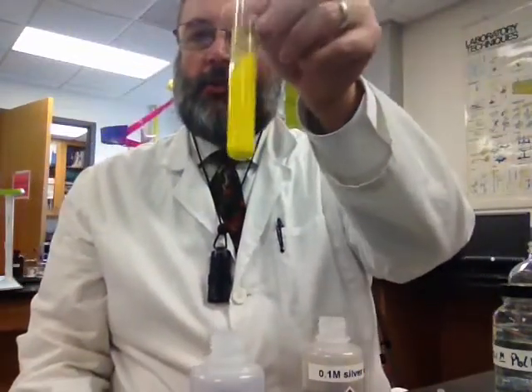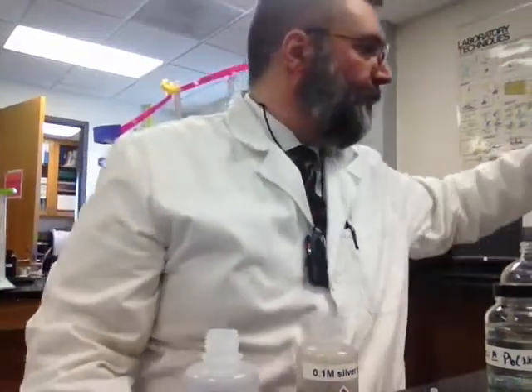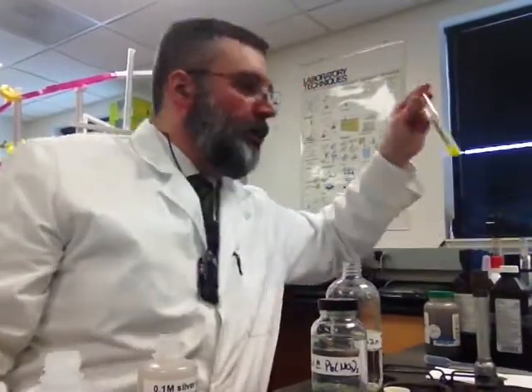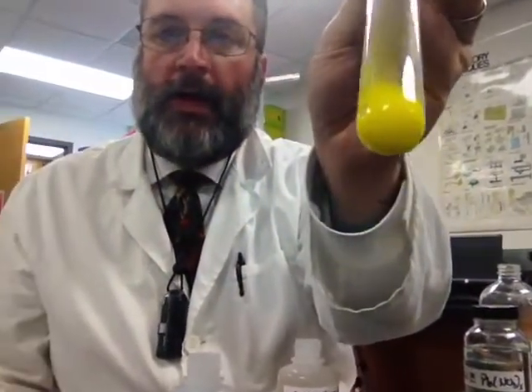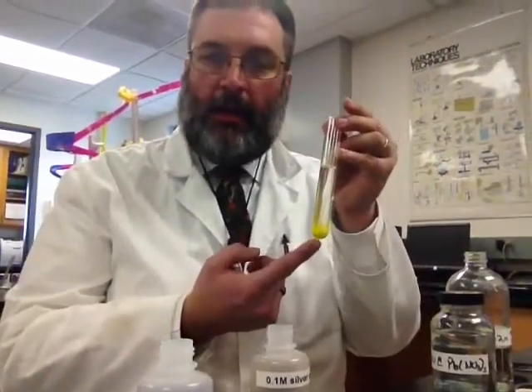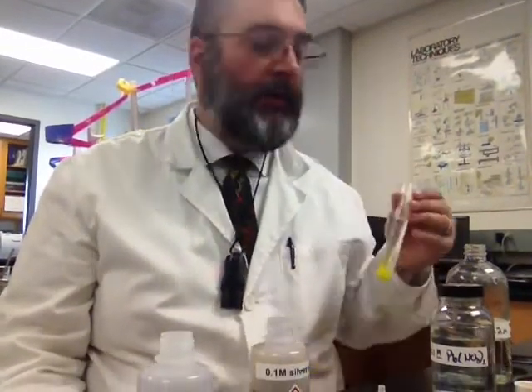That solid eventually is going to settle out. It'll look like this. See, there it is all at the bottom. And the solution above it is colorless again, clear and colorless. That solid at the bottom we call a precipitate. Okay, and you should be able to tell what that one is based on whether or not you know how to do these reactions.